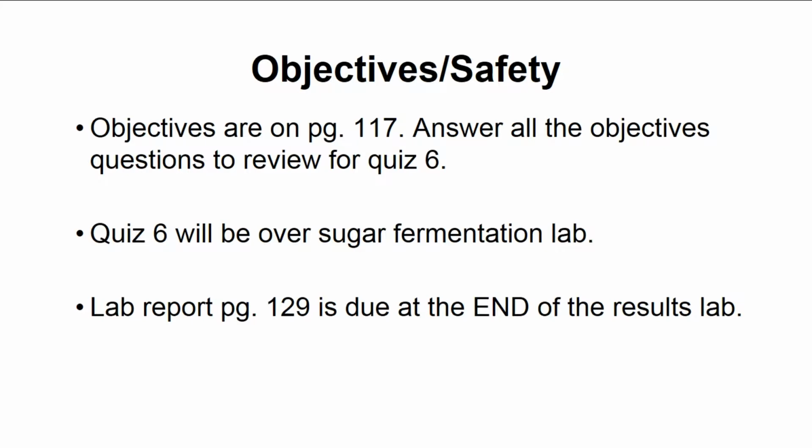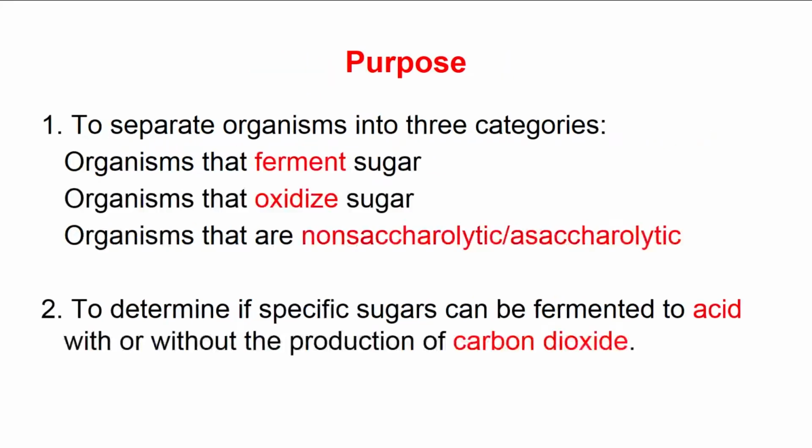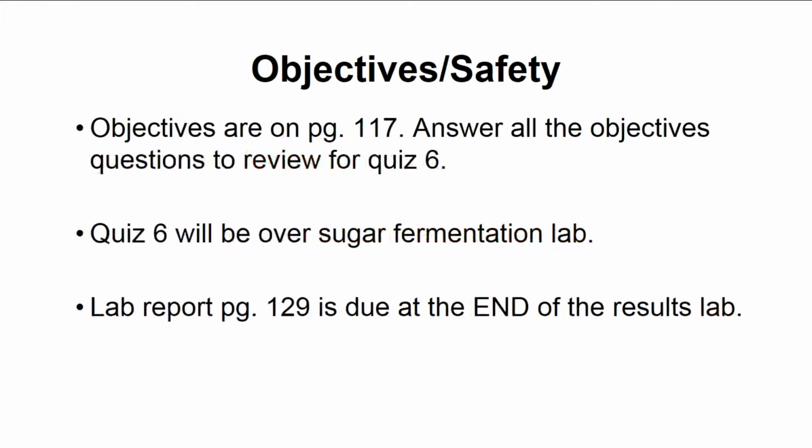The quiz will cover sugar fermentation lab. There will be a lab report due at the end of lab as usual. Some safety stuff to consider is that we will be using some BSL-2 organisms. Make sure you guys follow proper safety protocols as usual.